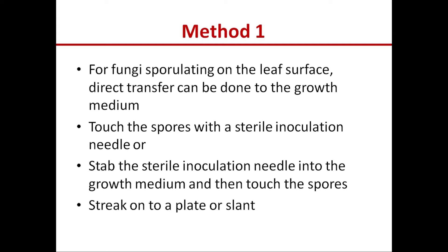To perform direct transfer, touch the spores on the leaf surface with a sterile inoculation needle and inoculate the medium in the lab. Alternatively, stab the sterile inoculation needle into the growth medium so that some medium gets attached to the needle and it becomes wet. When the wet needle is touched to the spores, the spores come easily onto the inoculation needle. After touching the spores, streak the inoculation needle onto a plate or slant to transfer the spores directly to the medium.